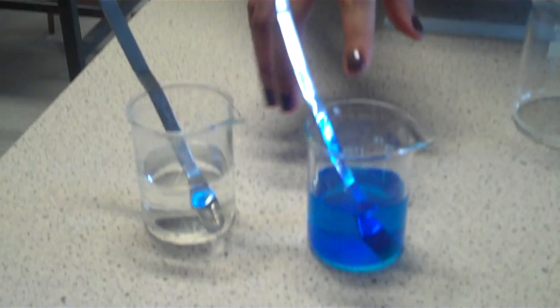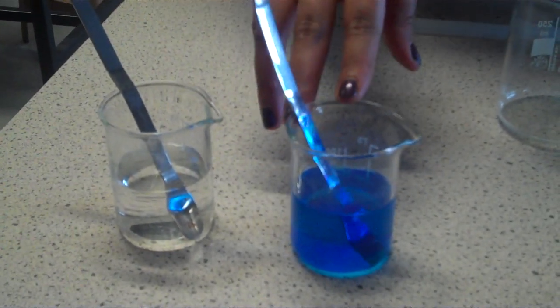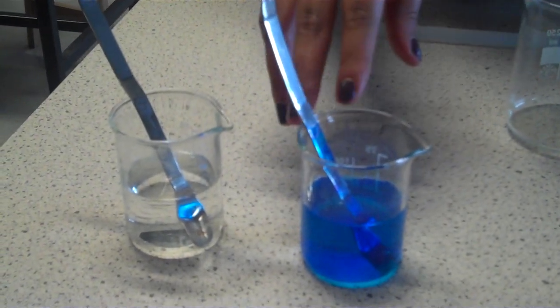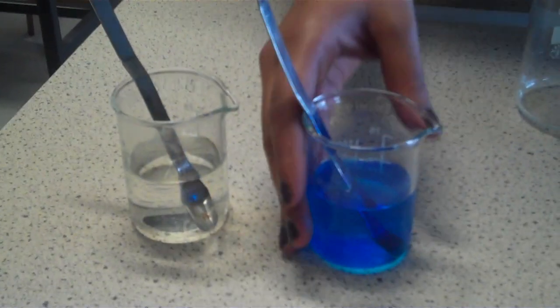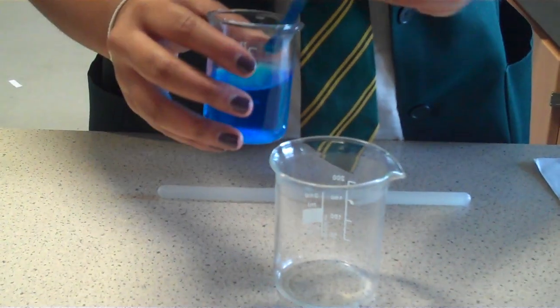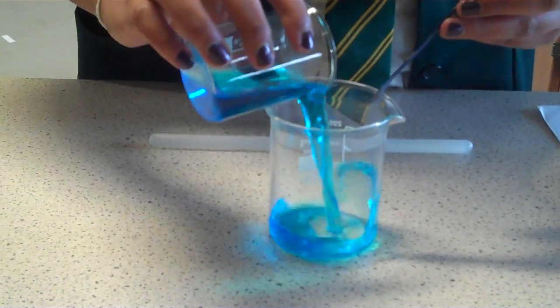To make malachite green you need two solutions. This one has got 12.5 grams of copper sulphate dissolved into 50 millilitres of distilled water, and it goes in this beaker and it has to be stirred rigorously.